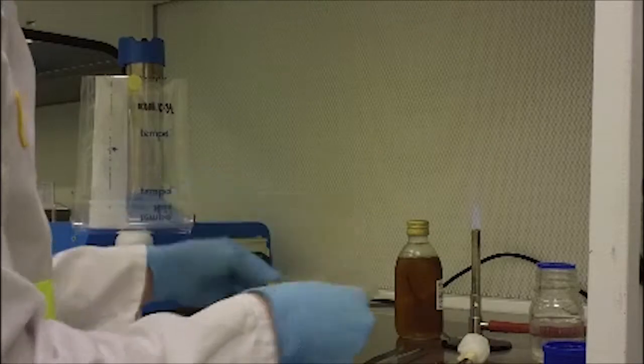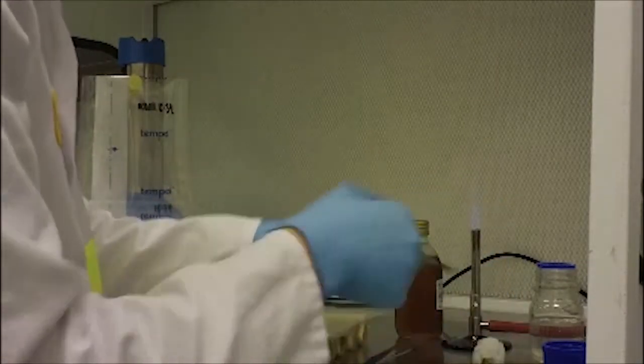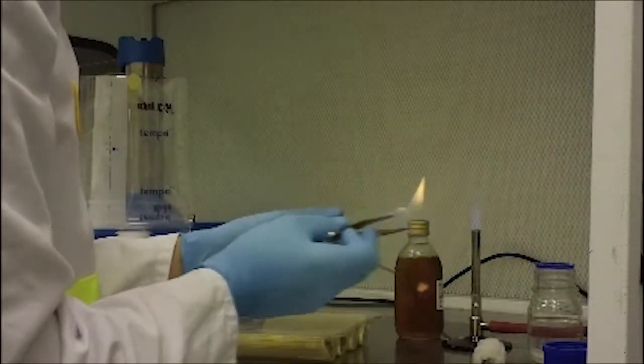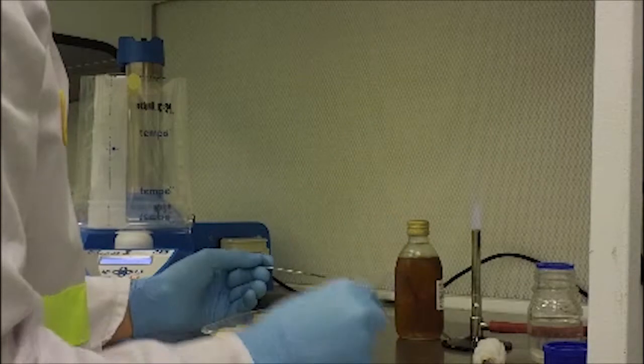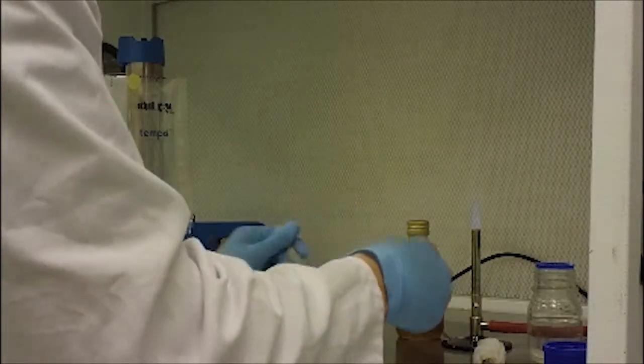Today I'm testing for Listeria in a cannelloni pasta product. The role of any microbiologist begins with making sure that the area is clean and disinfected, and this also goes for any tools that I'm using such as scalpels or forceps. After you've made that happen, you begin with your sample extraction.